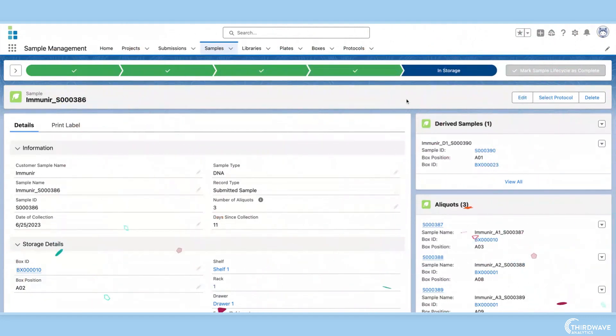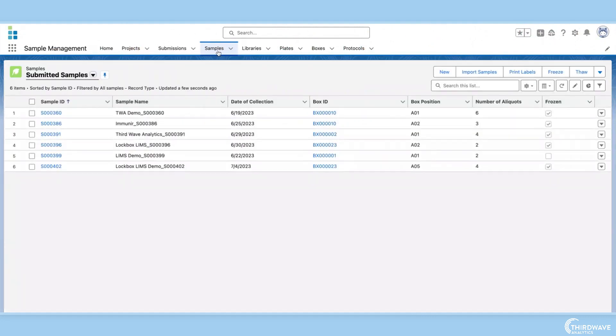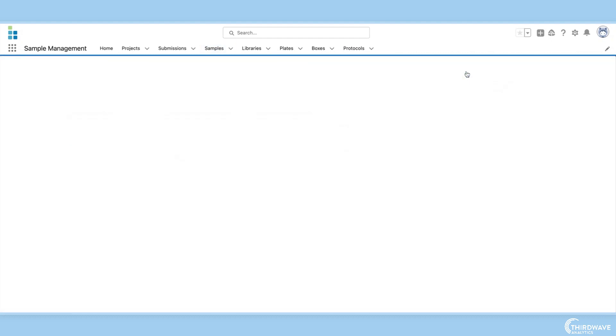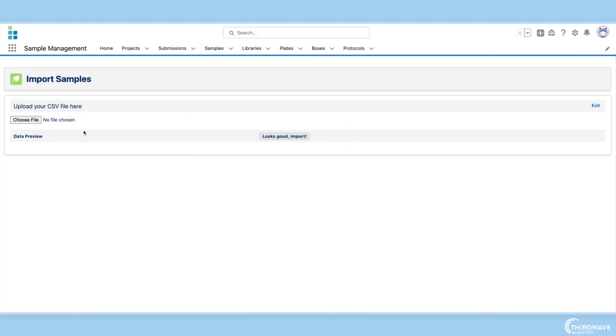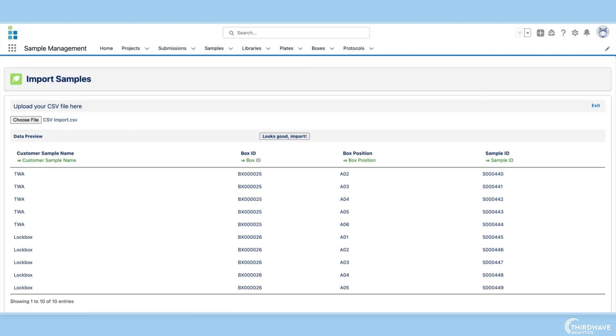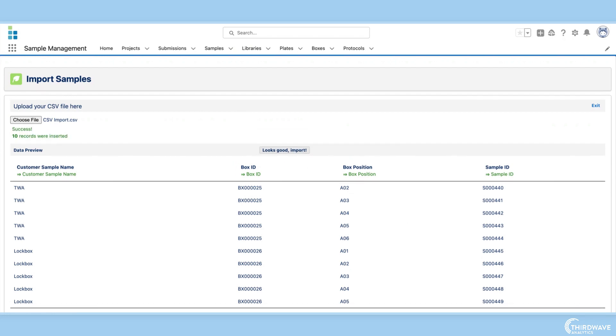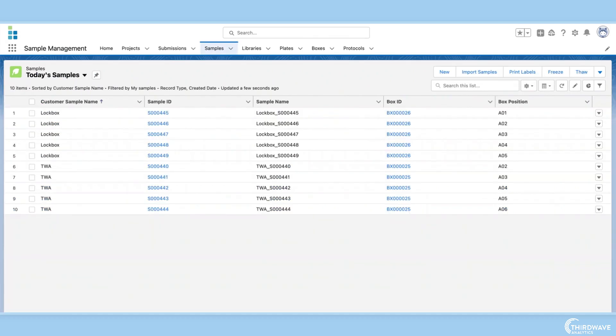Many labs work with high volumes of samples, so the LIMS must also be able to create multiple sample records simultaneously. Lockbox LIMS supports the simultaneous creation of multiple sample records through its CSV import functionality. Just import a CSV file with your sample information and Lockbox automatically updates the sample records.